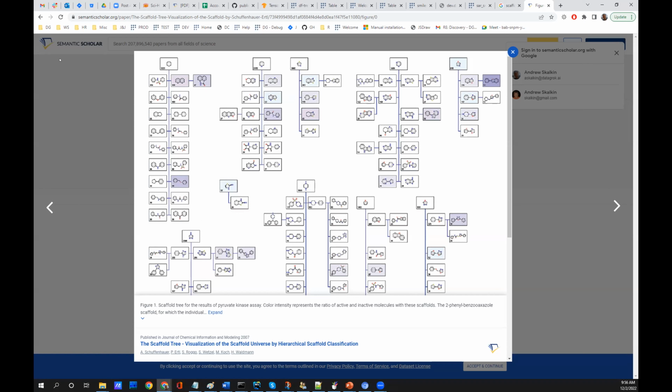And there are different ways to both automatically generate this classification and also interactively navigate. We've almost completed the implementation at the moment. In fact, we were planning to demo it today, but I decided to postpone it. And next time it will definitely be ready.